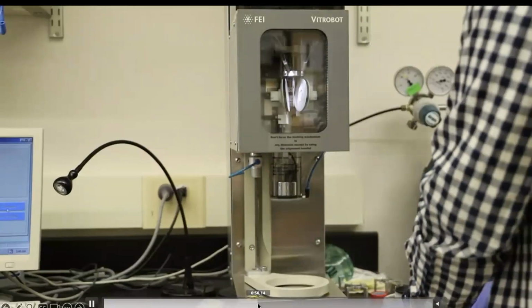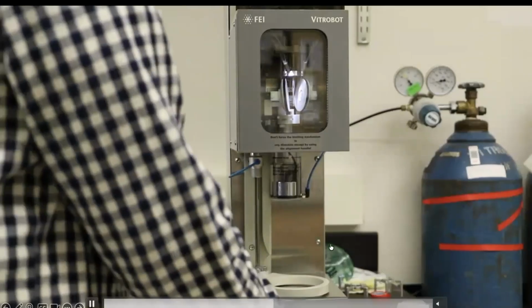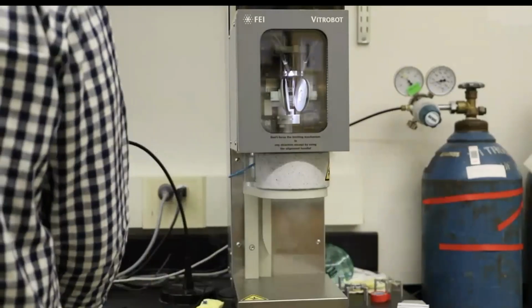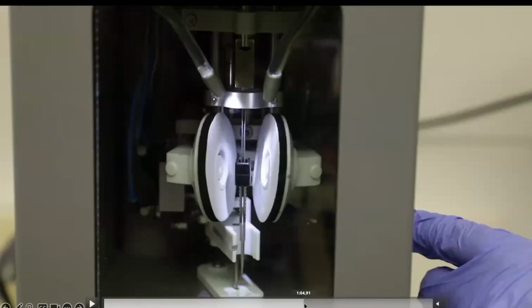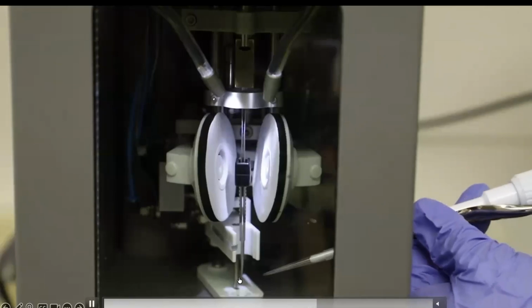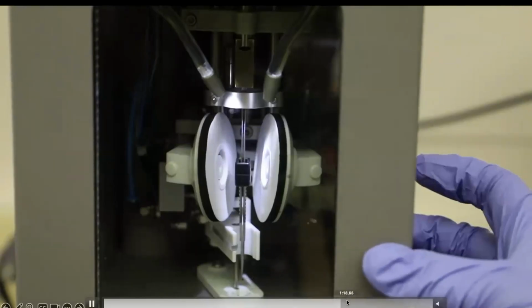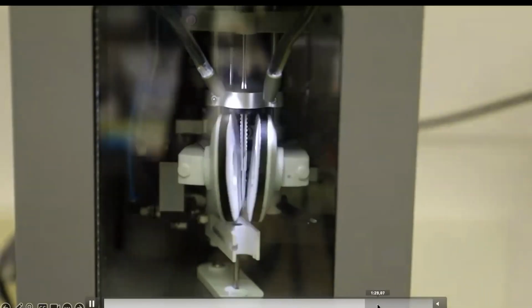You take the same TEM grid that I have shown previously for blotting, and then you add the sample here, about 2 to 3 microliters. Here are these filter papers, and this automatically blots, and that makes an extremely thin ice layer, less than 100 nanometers, where the sample is embedded in the ice. Therefore, the ice acts as a matrix here. Now we can take this and transfer it to the instrument and start imaging.